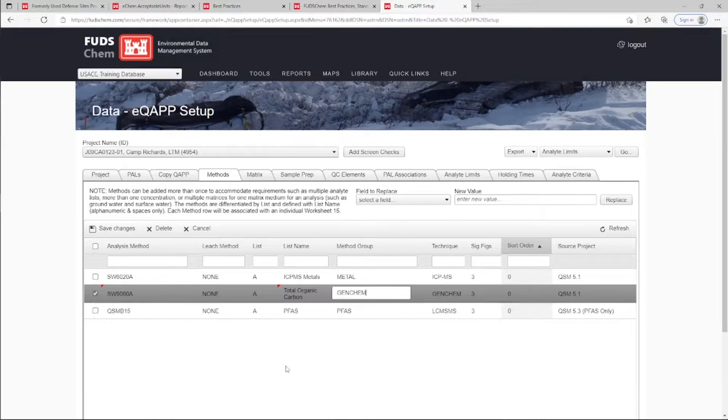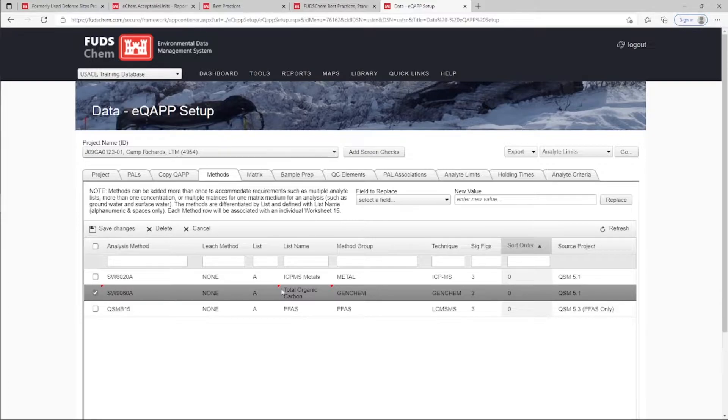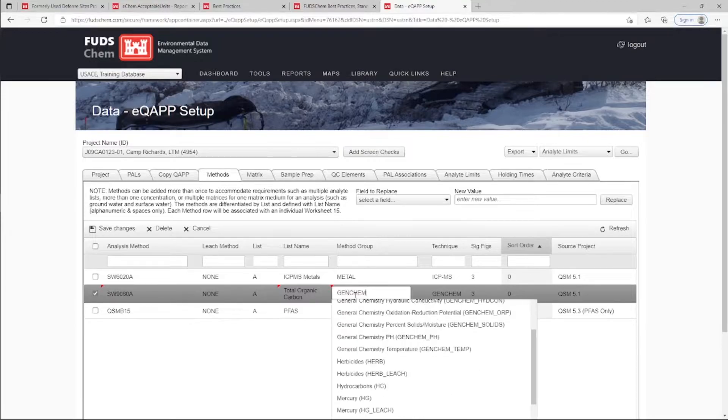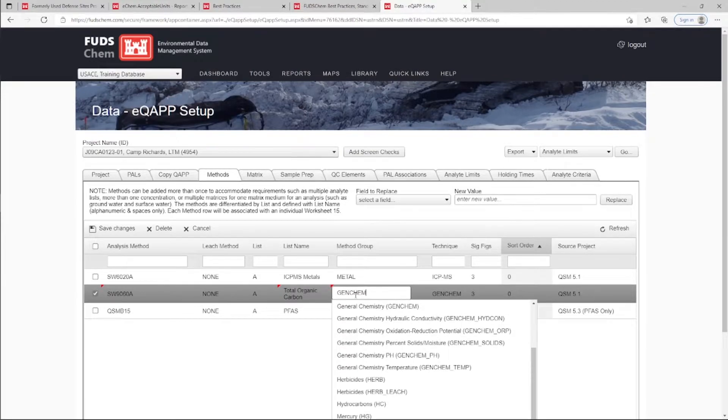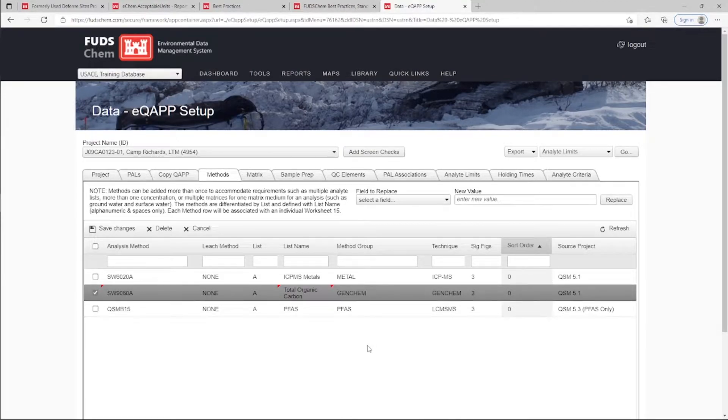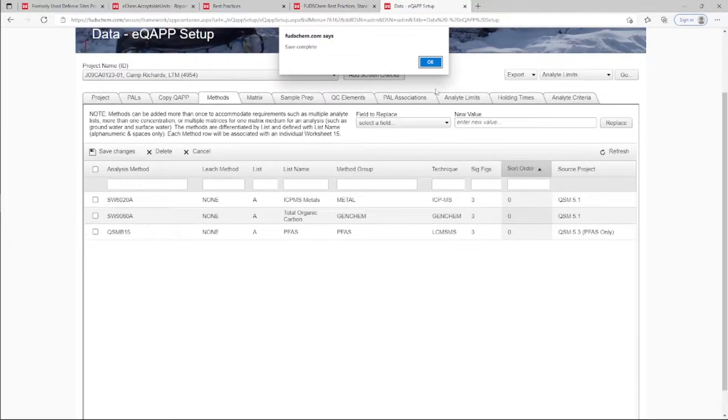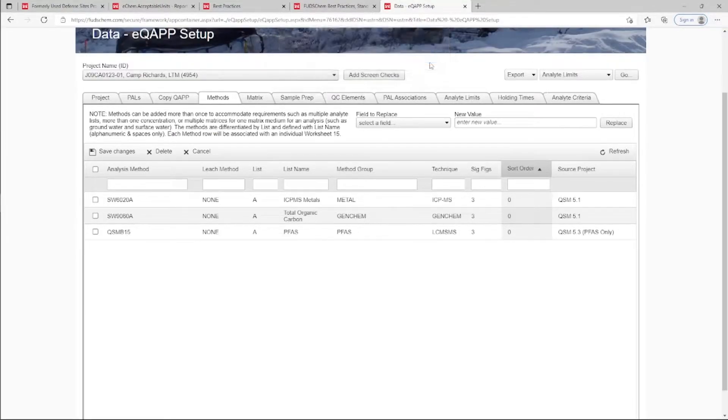In the case that a method is changed in this interface, the method group can be edited by clicking on the text and selecting a new option from the drop-down menu. Please reach out to your Synactics Point of Contact for assistance in determining what the correct method group would be.